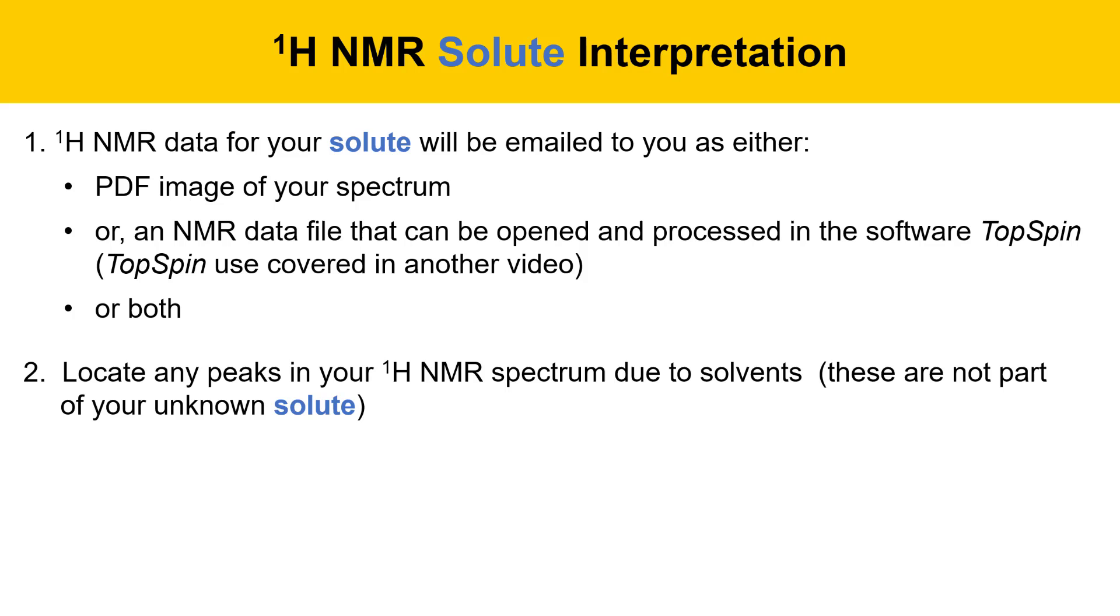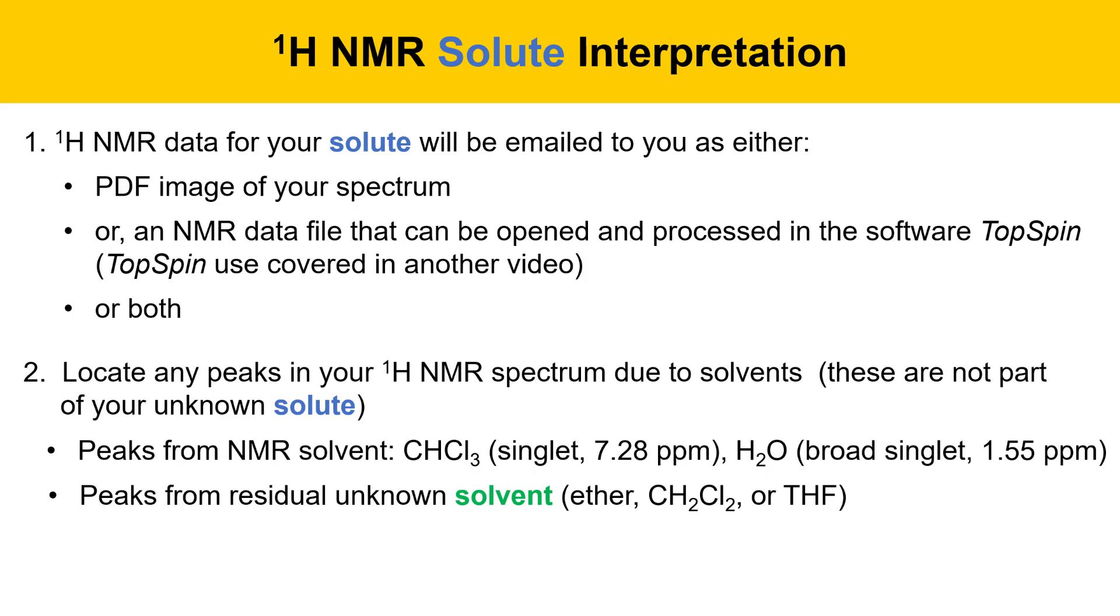You need to locate any peaks in your proton NMR spectrum that are due to solvents and recognize that these are not part of your unknown solute. These come from peaks due to materials in the NMR solvent, like CHCl3, that's a singlet that appears at 7.28 parts per million. Water is often also present as a broad singlet at about 1.55 parts per million. Then there could also be peaks from residual unknown solvent that are present. If your unknown solvent was ether, you might have ether peaks. If your solvent was dichloromethane, you might have a dichloromethane peak. Or tetrahydrofuran peaks if your unknown solvent was THF. On subsequent slides I'll go through all of these and show you where those peaks show up. Once you've located all the solvent peaks that could possibly be in your spectrum, then you should assign the remaining peaks to your unknown solute.